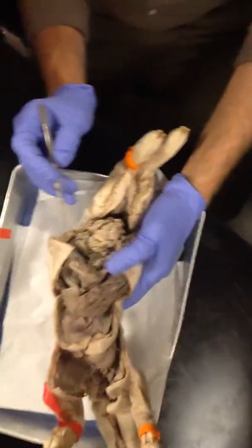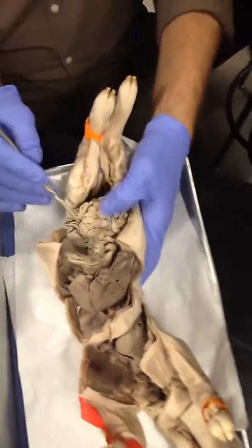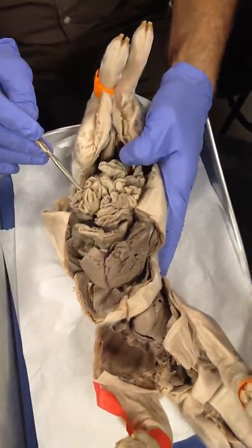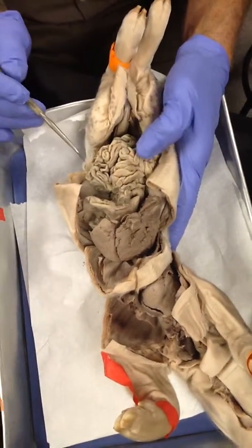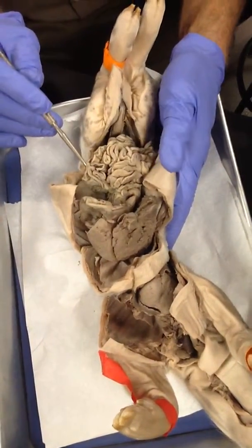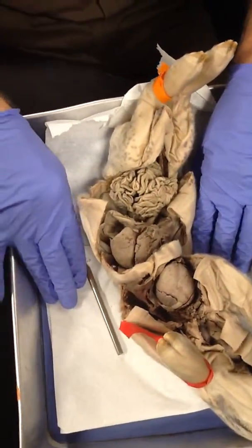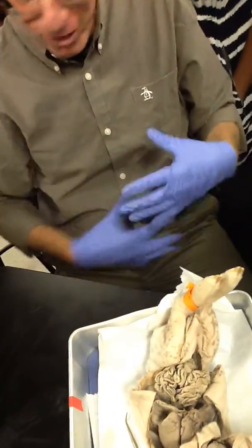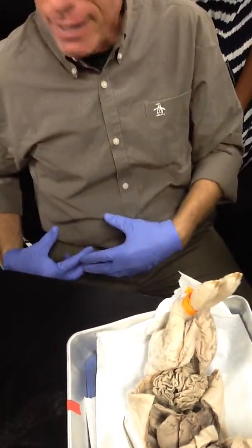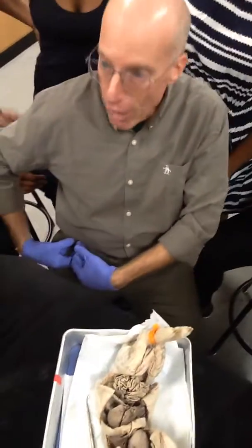Okay? And then the rest of it, there's not that much to it. And the truth is, the pig's large and small intestines are very different than humans, so we just look at this as small intestines here. And for humans, our plastic models are not that great either, so just know this. You get that jumble of small intestines, kind of centrally in the abdominal cavity, and then they all come down in us to the lower right quadrant.